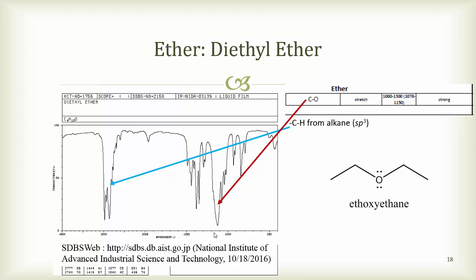Something that I use as kind of a help to me is the fact that the molecular formulas of ethers do have oxygens in them, and you aren't going to be finding any alcohol stretches or carbonyl stretches, which kind of helps you know that it's not going to be one of those 2 types of groups with the oxygen. And I know I haven't shown this to you yet at this point in the video, but I will. Alcohols and carbonyl stretches are very distinct in the IR. And since I don't see either of those 2 types of signals in this IR, it also helps me to understand that this would be an ether.